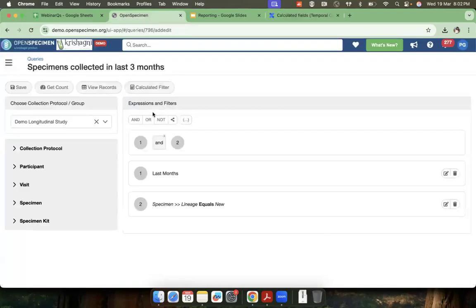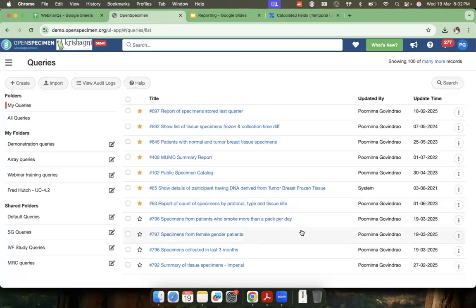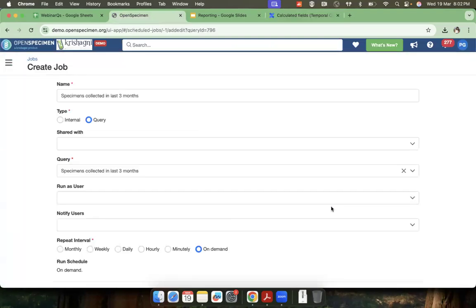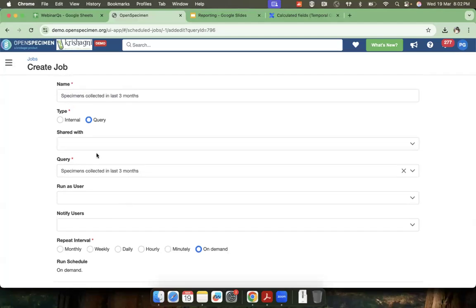Now once I have this query, if I save and schedule it, I'll be able to say, okay, run this every month or whenever you want. You can also share it with others, or notify users as well.